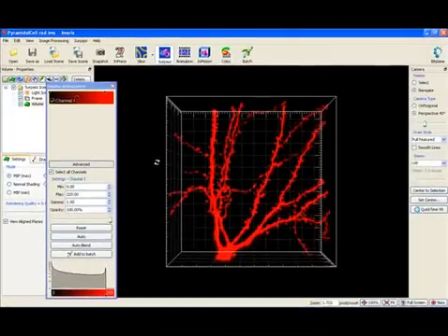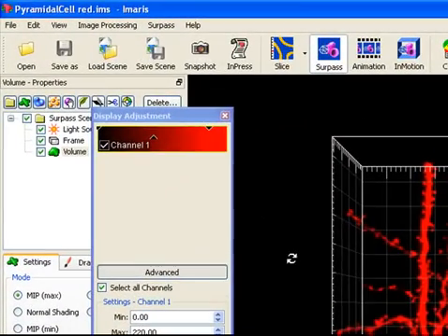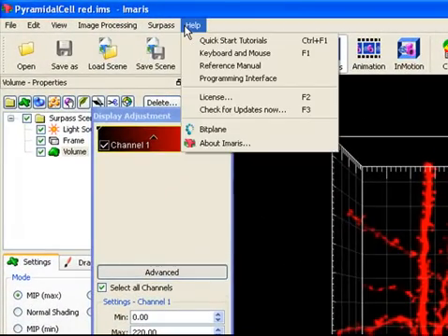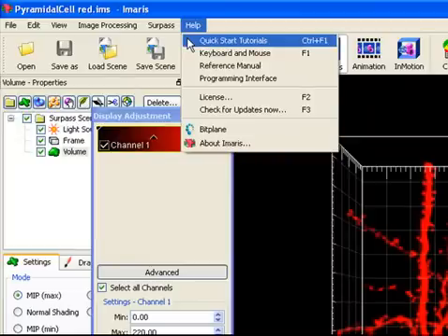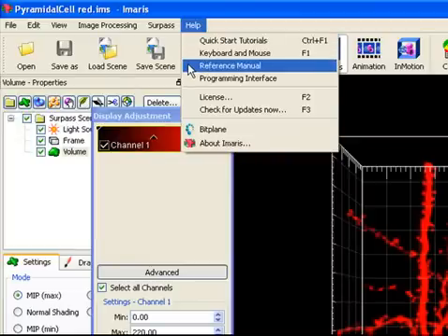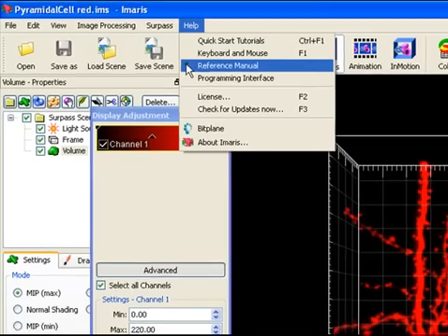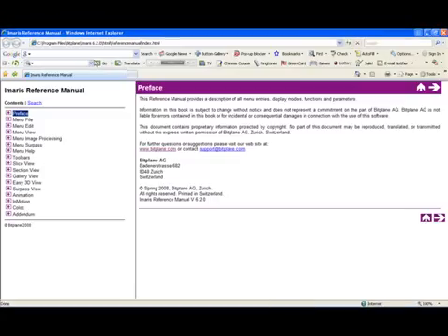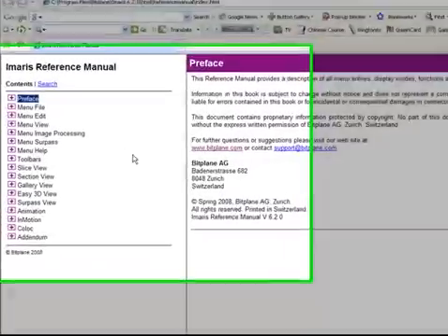In the help menu you can find additional information. Here you can access the quick start tutorial, keyboard and mouse shortcuts as well as the reference manual. The reference manual provides a description of all menu entries, functions and parameters.